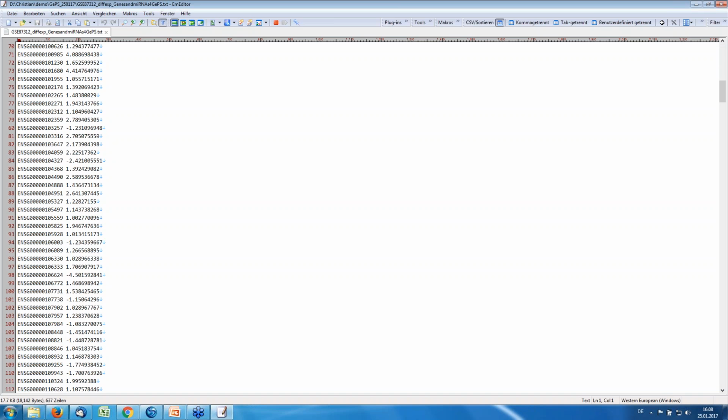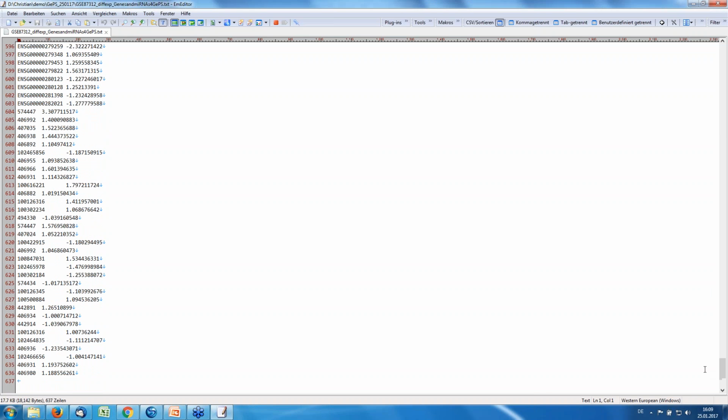We also have some number of identifiers for microRNAs in the system, which are down here. These are actually NCBI gene IDs for these microRNAs. So you can mix types of identifiers. You just need to be in the same category, so it's a gene ID in any case.